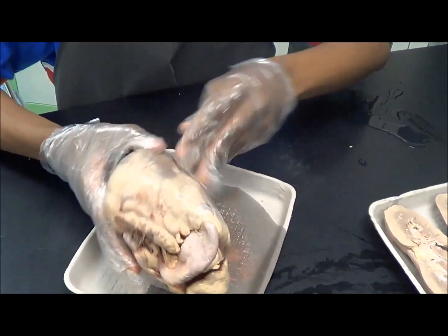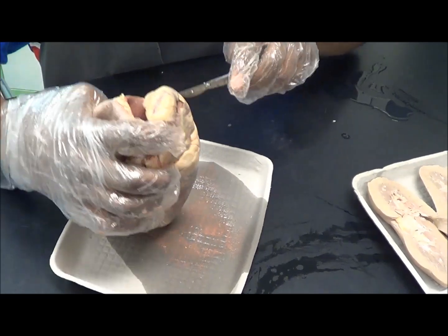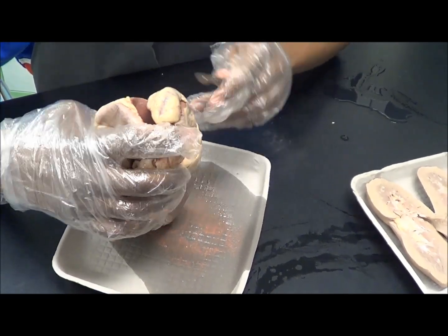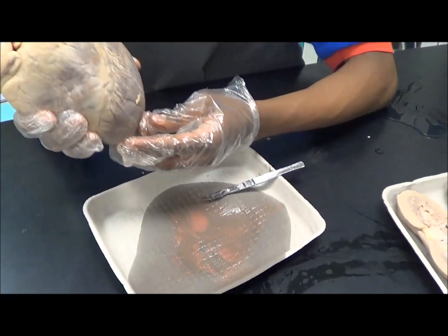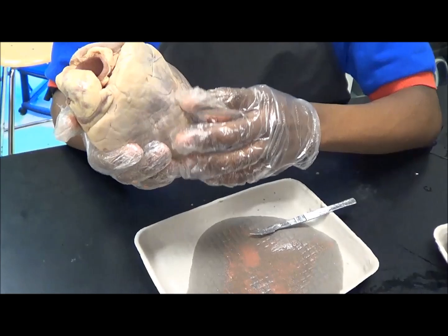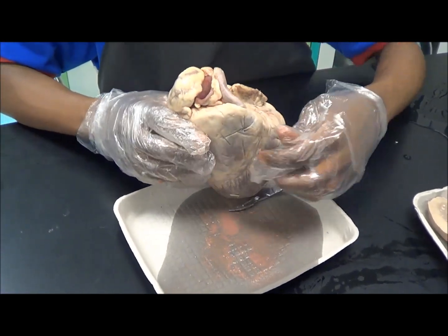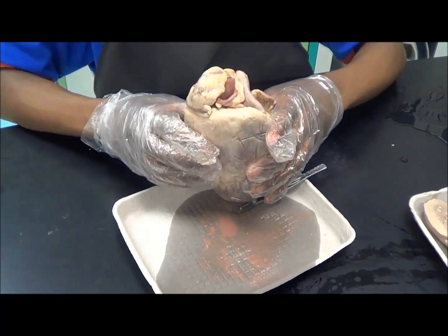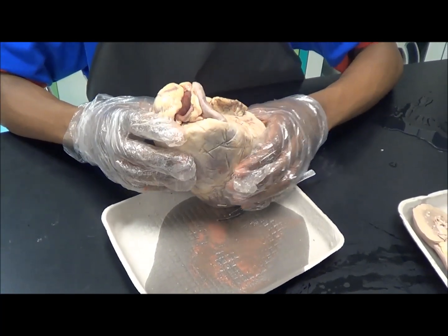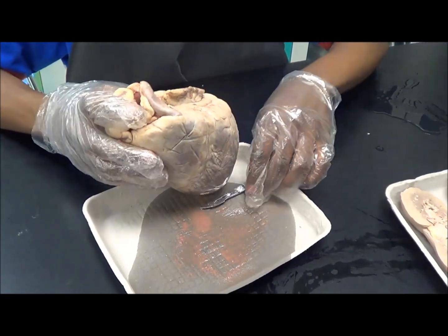To do this, you'll have to get the scalpel, and you have to be careful because the heart is slippery and it's a tough muscle. But before you start, the bottom of it is called the apex, and the top right here is called the base. The way you can tell the left side from the right side is the right side will be thinner than the left side, because the right side only pumps blood to the lungs, and the left side pumps blood to your entire body.